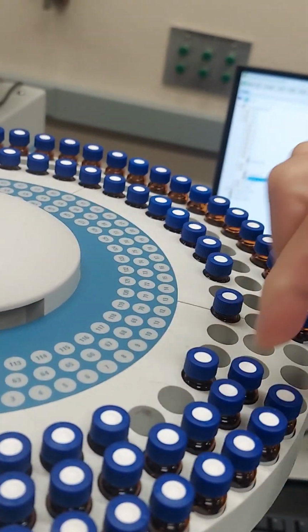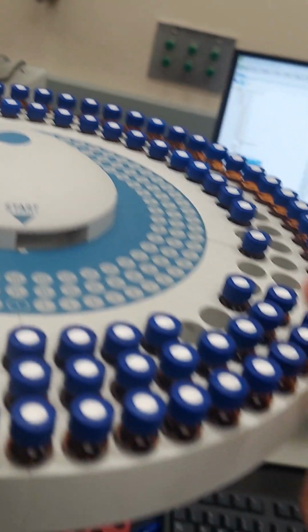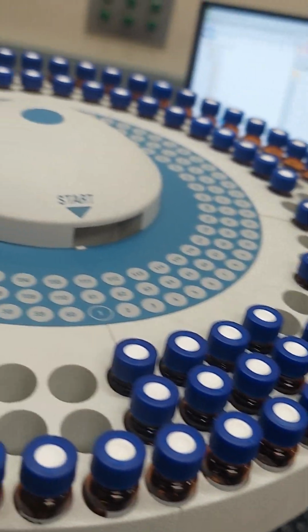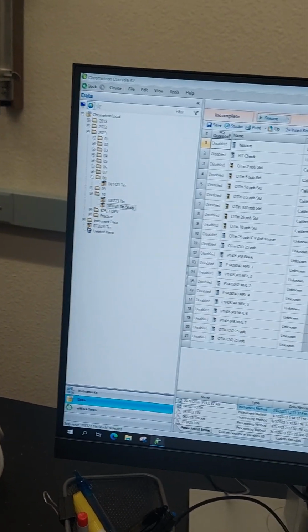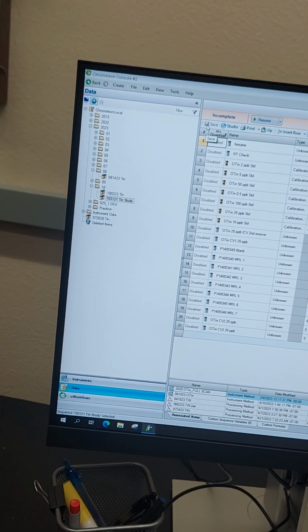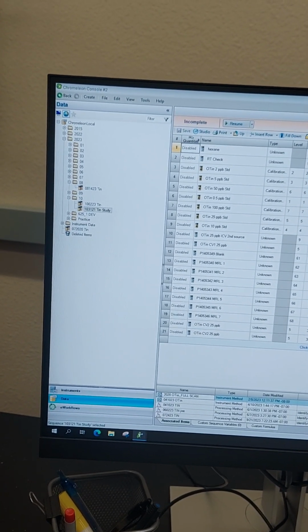These shouldn't be closed. It's a new cap. You changed the recap. Yeah. I just ran this one, so that's why it's been used. Okay. Then you save it. Yeah, you have to save it pretty often. Pretty much every time you make a change, you have to save it, or else it doesn't keep the save. Okay.